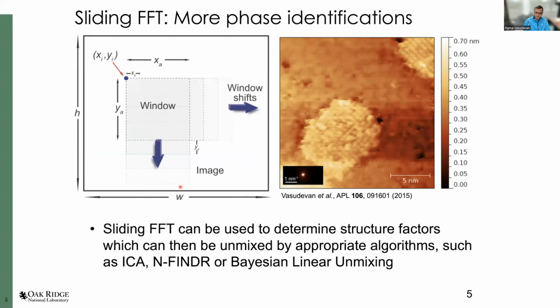And so what is texture analysis? Texture analysis is really just showing you what kinds of textures are available in any kind of image. In this case, this is another image that I captured on a manganite with scanning tunneling microscopy. You can see there are two different kinds of terminations. This happens to be the lanthanum calcium oxide termination, and this one happens to be the manganese oxide termination. Doesn't really matter for the purposes of this case. But basically what we want to do is identify the phases that are present in our image, and then identify the spatial distribution of those phases.